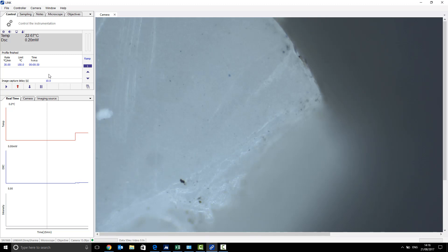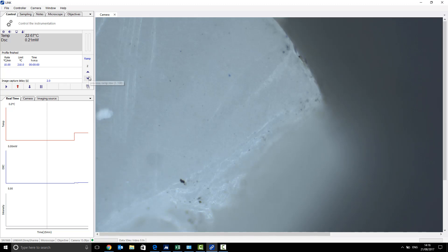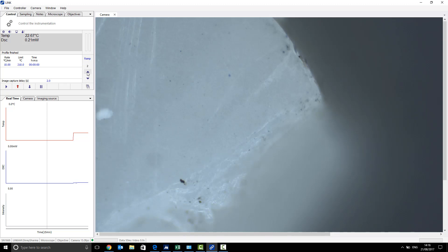This is because our desired temperature range for this sample will be, for example, let's say from 150 to 210. So the first ramp will only take you to your desired, to the start of your desired temperature range, and that's when it will start recording. So your recorded data will be from ramp two and three and four and so on.